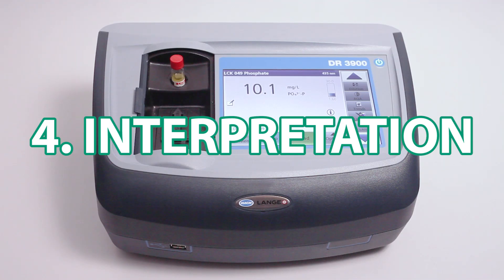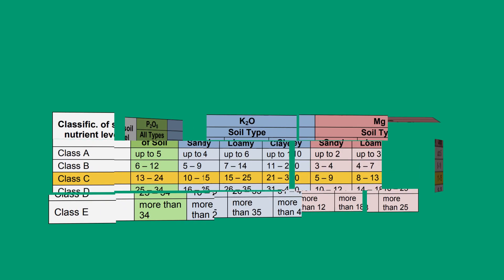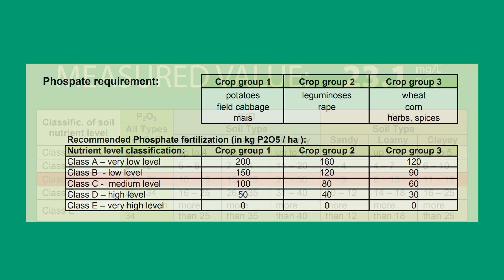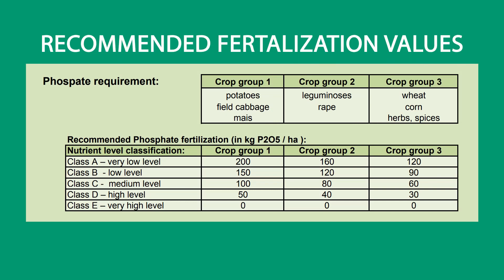Step 4 of the complete Lassa Agro system is to provide information for the evaluation of the analysis results, the interpretation. There are two possibilities. First, the analysis results can be checked in the nutrient level table, which comes with the instrument.